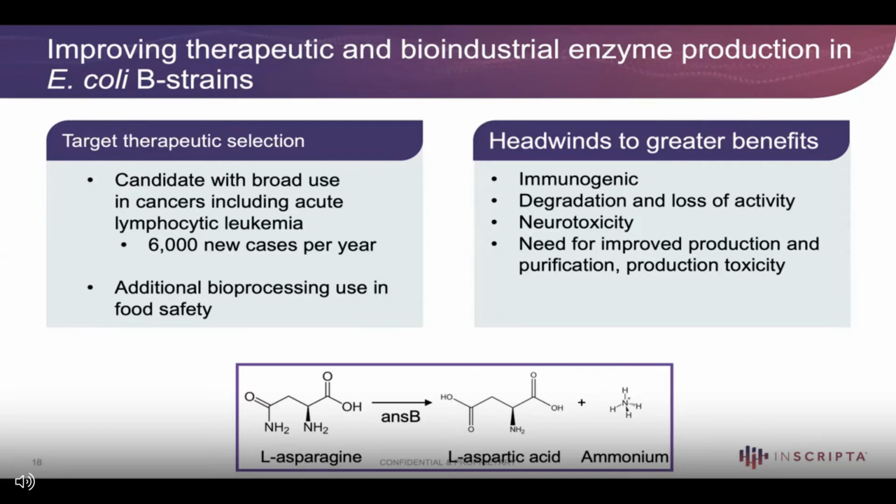And so there's a real need for improving the production, improving the enzyme, and yet when overproduced, it's toxic to E. coli by definition from its starvation use case. And so there's a real need for improving also the host to be capable of producing highly active variants.